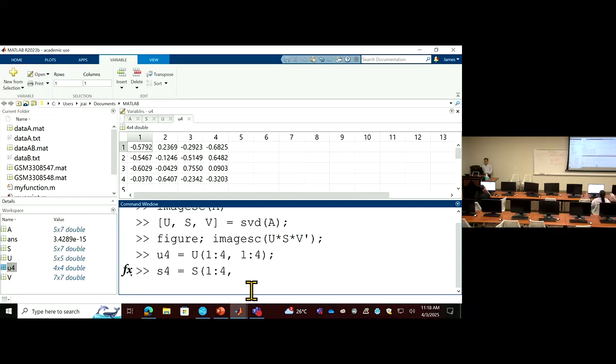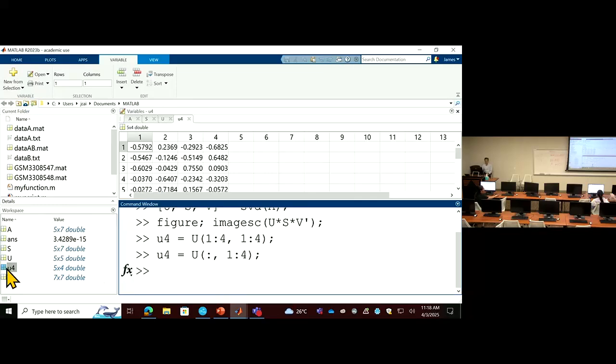We still need, I made the wrong answer because we still need, sorry about this. So we still have to have 5. We still need the top 5. We reduce the number of components, but we still have to keep 5 samples, because at the end we will construct the matrix with 5 rows.